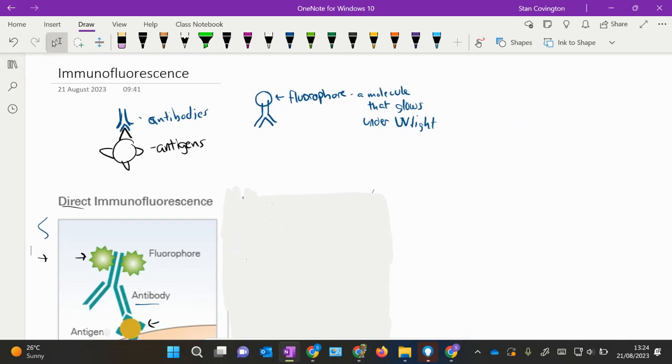Okay, so in today's lesson, we're going to look at immunofluorescence here. Right? And this idea here, immuno comes from immune system, and what we're talking about there are antibodies. Fluorescence is the idea that certain molecules, when put under a certain type of light, in this case, usually UV light, will start to glow. Okay, and scientists use these two concepts to study molecules in biology.